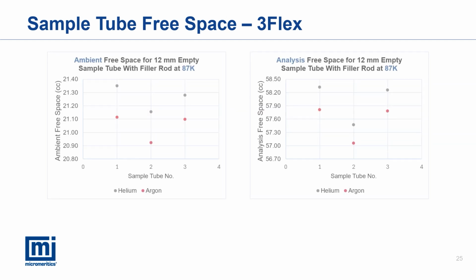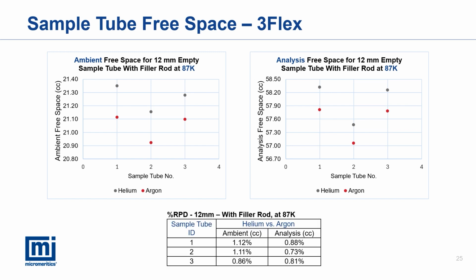The same empty 12 mm 3Flex sample tubes and setup were remeasured at liquid argon temperature. Once more, utilizing helium as a point of comparison, the relative percent difference for the measurements is around 1%.